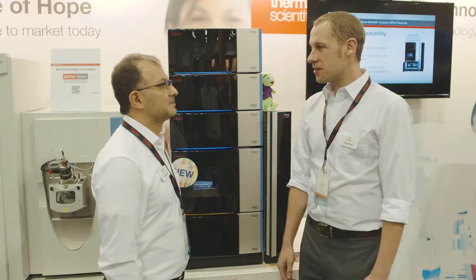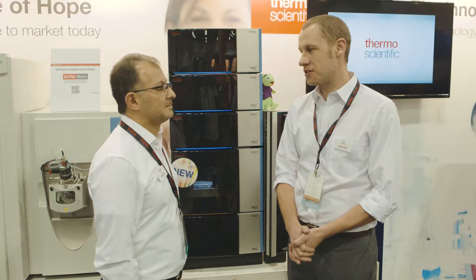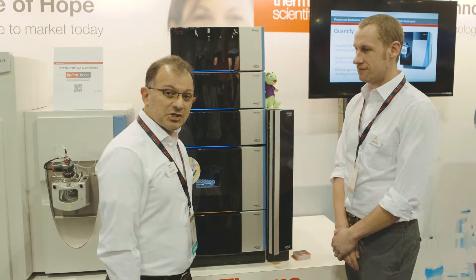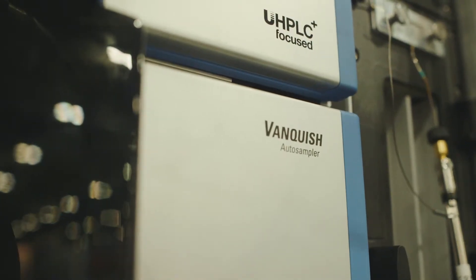We're here with Jarad, who's an HPLC specialist for North America. He's going to talk a little bit more about the Thermo Scientific Vanquish UHPLC system. So this is the latest addition to the Vanquish family — it's the Vanquish Flex Binary Pump.